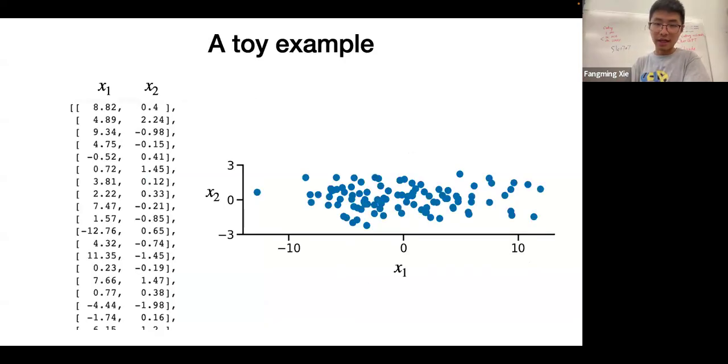So all of this is quite abstract. Let's take a toy example. Here we have a data table. It's not quite big, but we want to reduce it. This table has, I don't know, 20 cells. Each row is a cell, and there are 2 genes. Each column is a gene. If you plot it geometrically, these cells live in a 2-dimensional space, where x1 shows you the expression of gene 1, and x2 shows you the expression of gene 2.